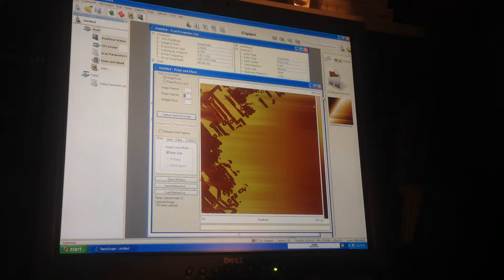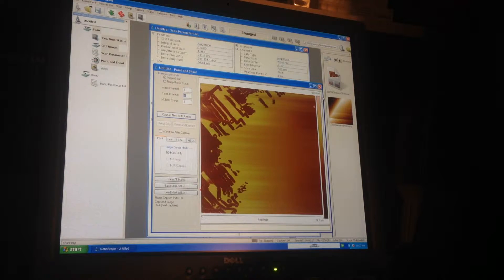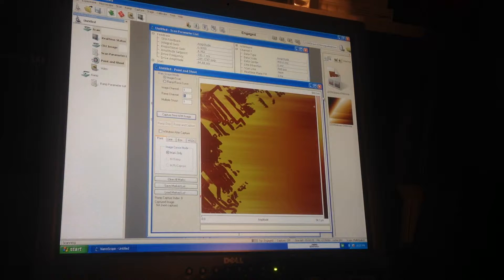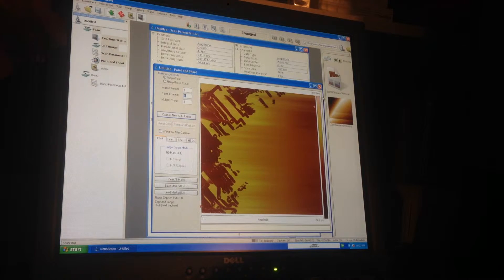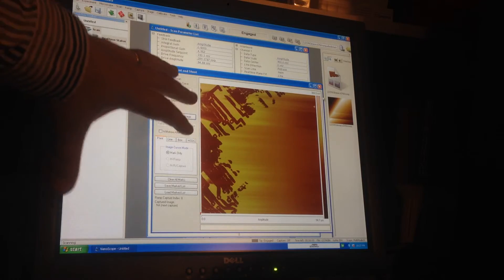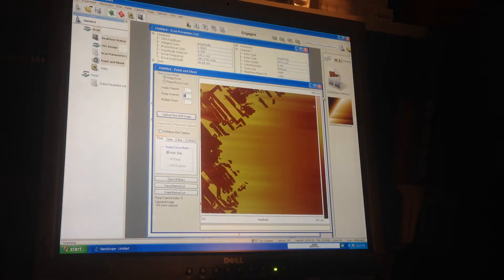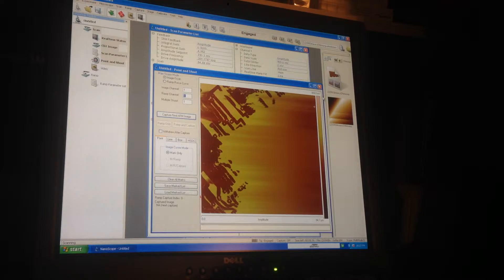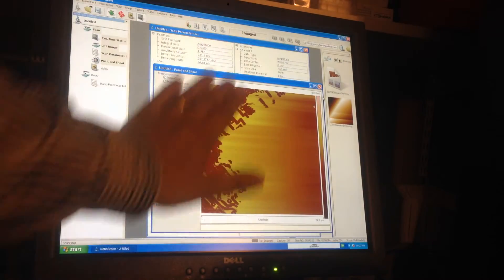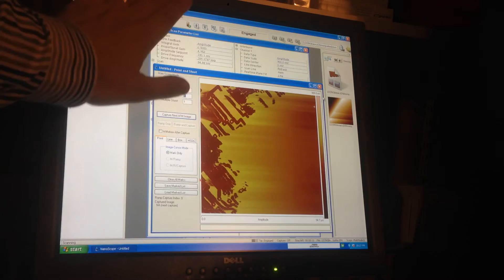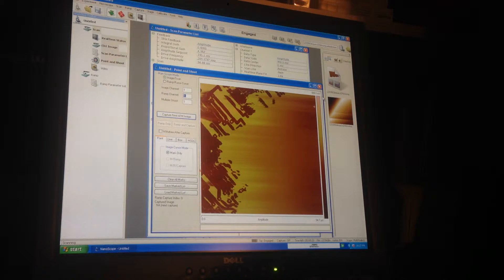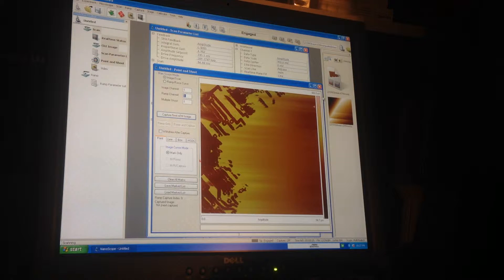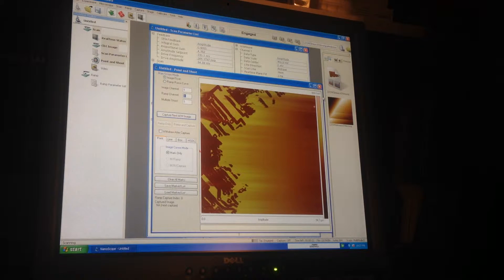It's not one of the big guys, it's not Xilinx or Altera. I'm pretty confident that these are real features on the FPGA. There's obviously still issues, so I've still got quite a few things to figure out. It's only generally imaging on this side and then it drifts off. I think that may be that I haven't got the tip aligned properly to the surface or the sample's at an angle, I'm not sure.